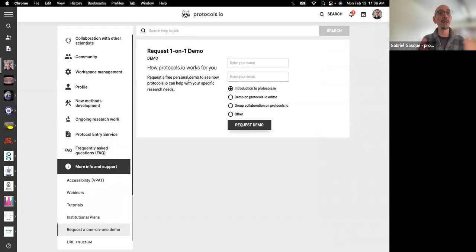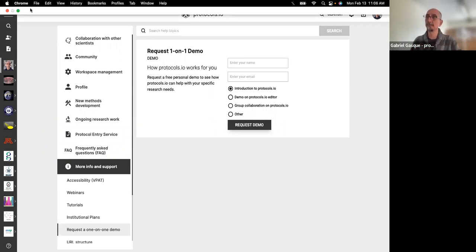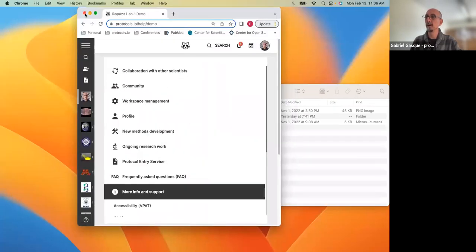In these demos, you will have the opportunity to talk one-to-one with one of our staff. We can share our screen, you can share your screen, and we can have a very dynamic conversation that will try to address any questions that you have about the platform. So now let me go back to my presentation.